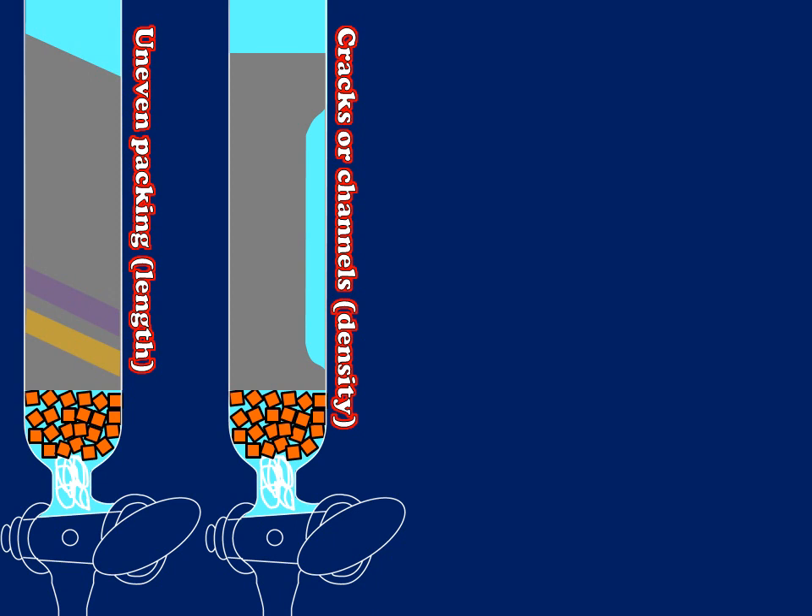In my second example, I have cracks or channels — this is a density-related issue. If a column has dried out or has been packed too rapidly, I can expect this to happen. When analyte is traveling through this channel within the column, it's not partitioning onto the stationary phase and therefore is moving faster. So even a well-loaded sample on this column is expected to generate a situation where separation is suboptimal.